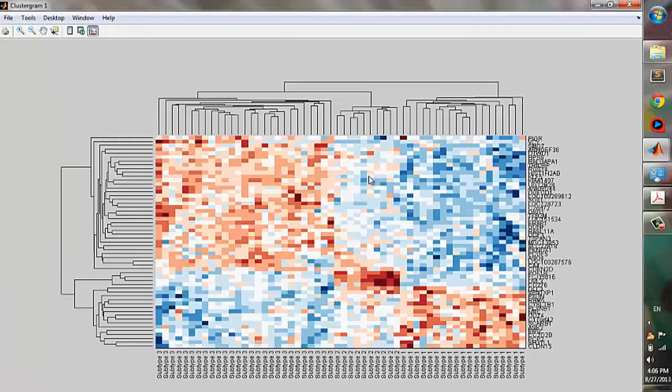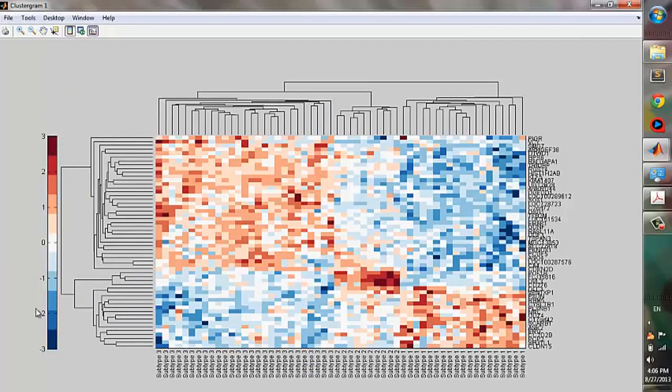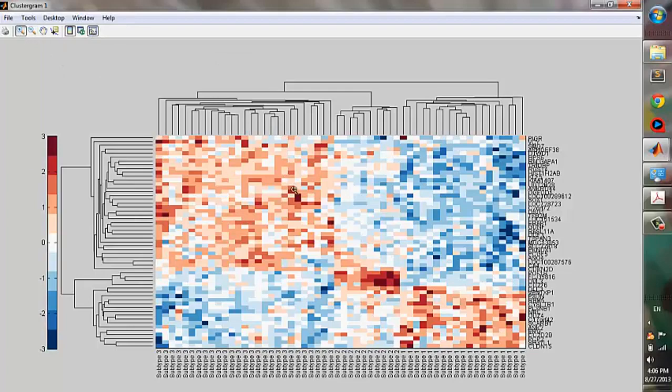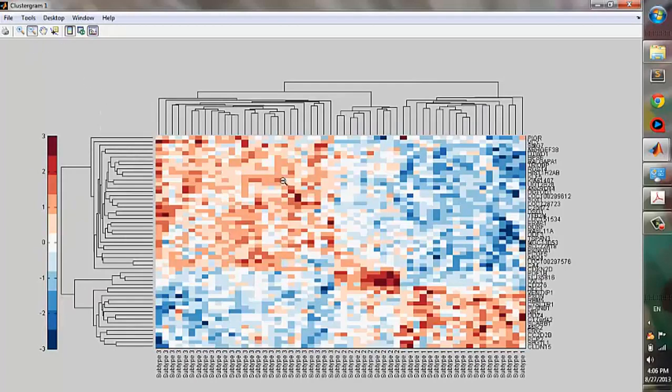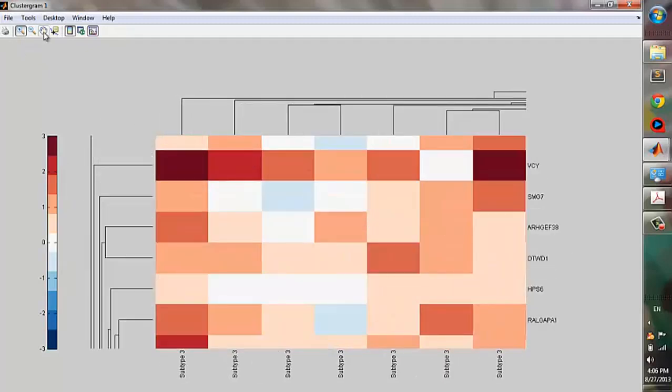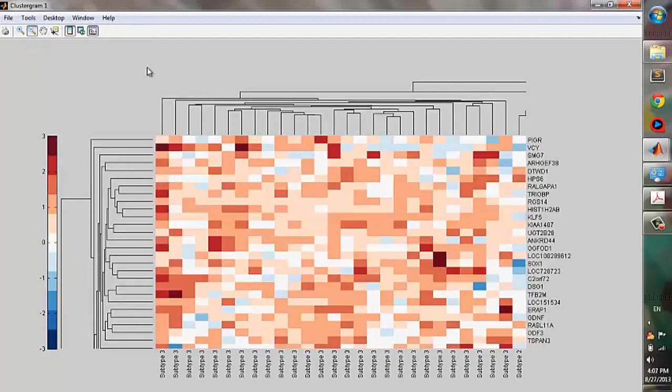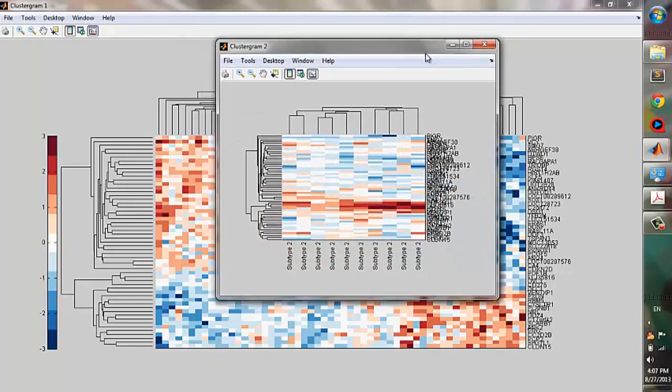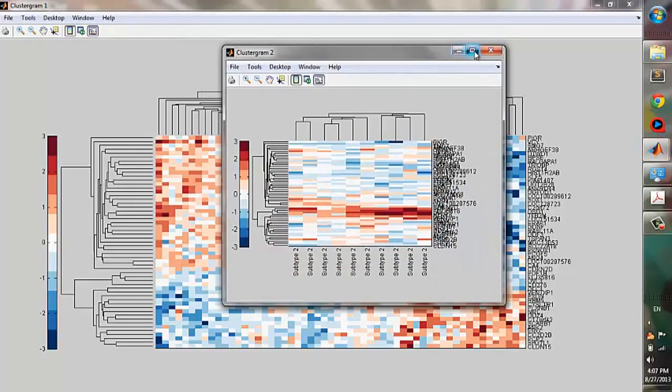After you get this clustergram, you can use this button to get a scale bar, and you can use this button to toggle the dendrogram, and this button to zoom in, and this button to zoom out. After you are in the zooming mode, you can use this button to pan over the figure. One nice thing about this clustergram is that you can select a subset of the clustergram and copy it to a new clustergram. Then you can examine this part of the clustergram in close detail.